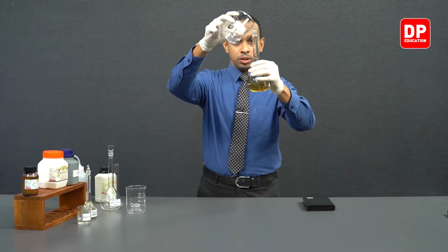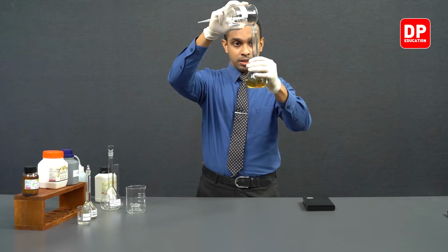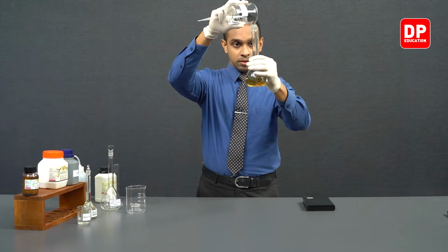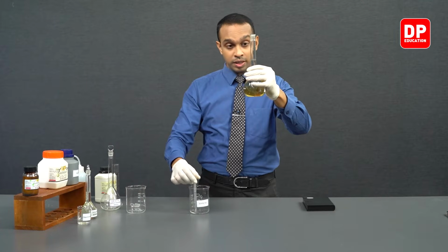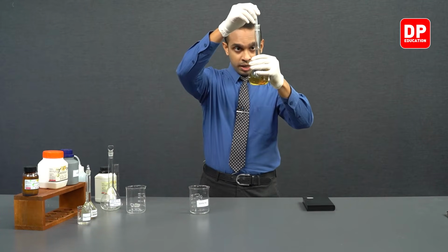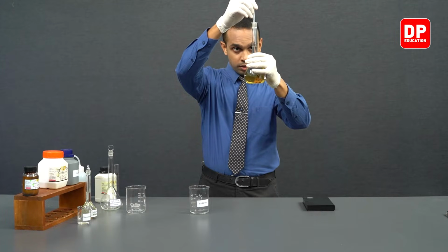So we can use the beaker, and then towards the final parts we can add sulfuric acid using a dropper. When we're adding the final few drops, we can add them with the use of a dropper like this.